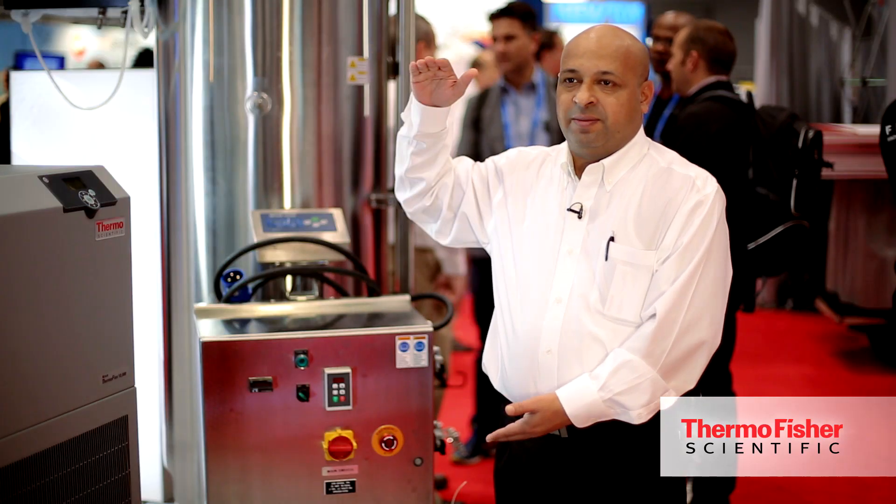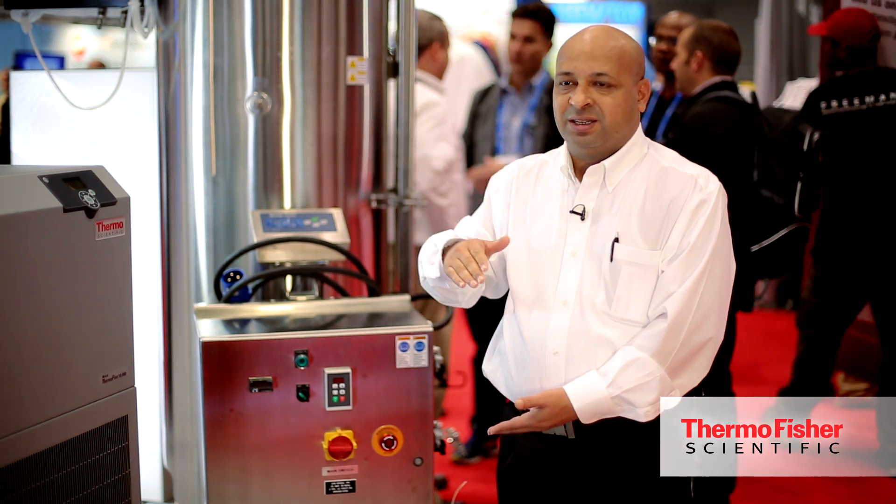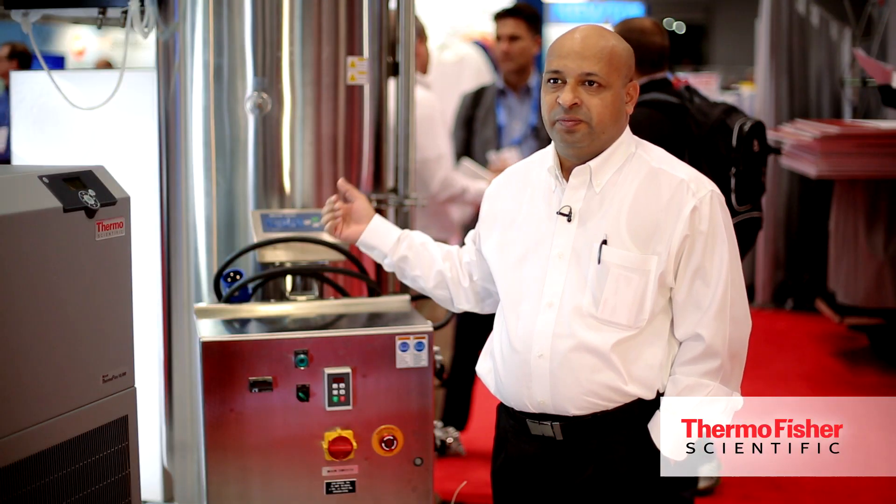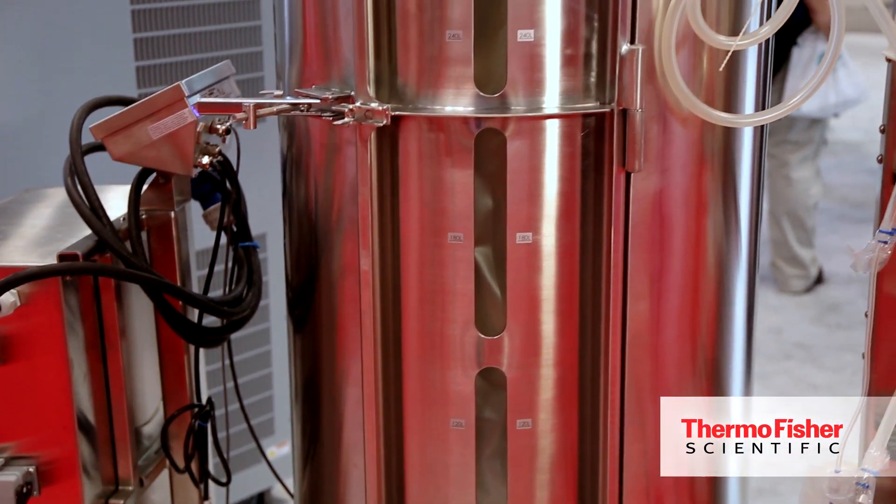Because of the positioning of the impellers, we can handle a 5-to-1 turndown ratio — meaning we can handle almost one fifth of the total volume. At 300 liters we can go down to 60 liters, and at 30 liters we can go down to 6 liters. Those are important features that help customers start with a lower volume and then scale up to a larger volume.